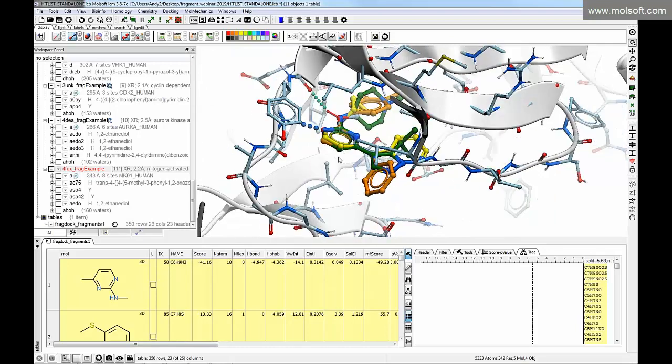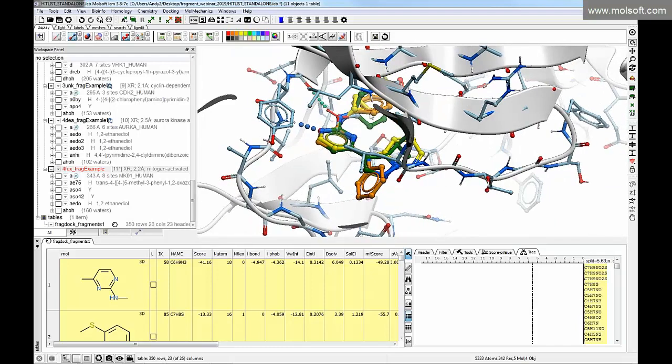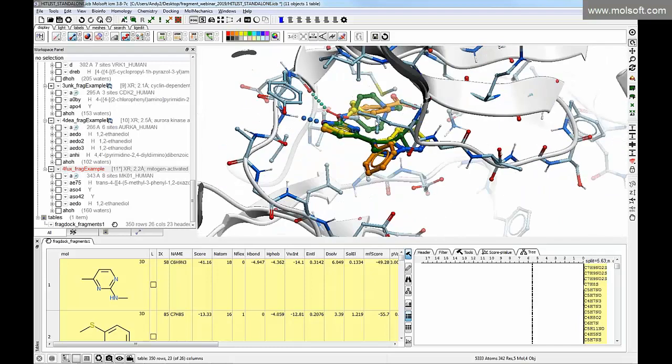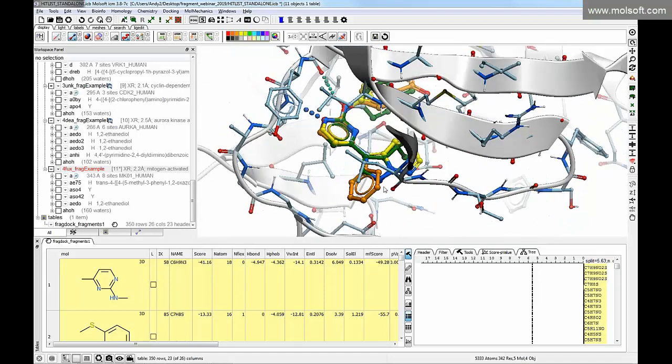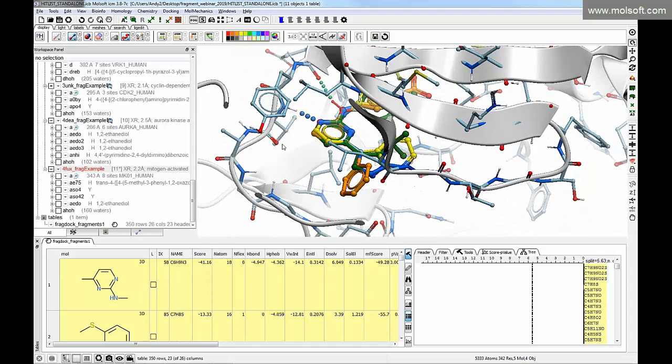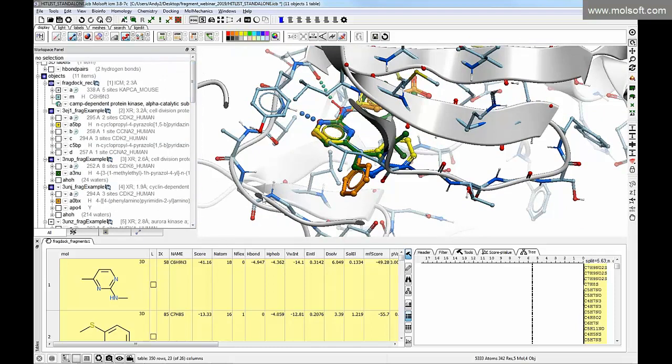If you want to copy other inhibitors from other proteins using this fragment, it gives you an idea where maybe you can grow, and also some ideas for the chemistry as well. So that's another way of evaluating the results. You can screen this small database relatively quickly, and it will give you some ideas of useful fragments.